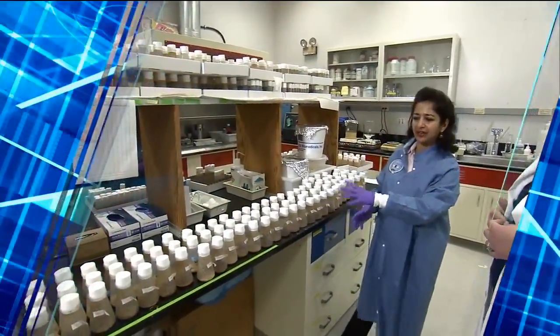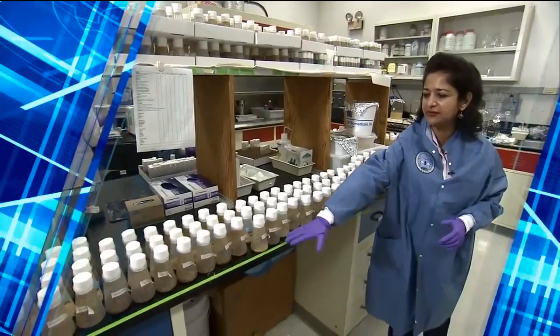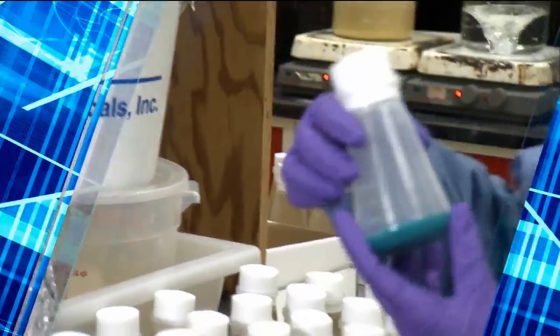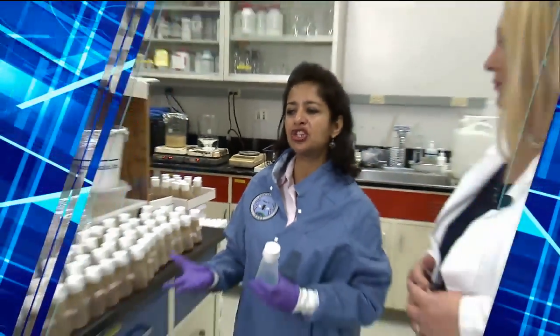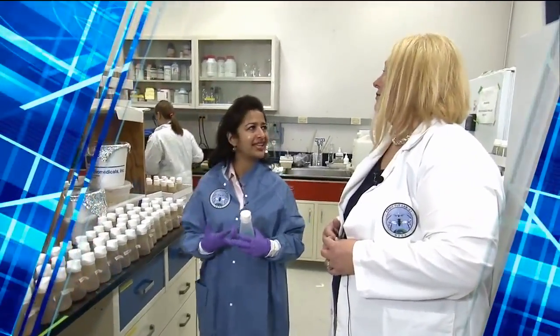What do fruit flies eat? So fruit flies eat a mixture. It's a nutritious diet. There are two different kinds of diets that we have in the lab. There's this food that you see in the white color, and then there's another one that we use for space flight that Shilpa was just working on, which is this blue color. We put this blue food dye in. But essentially it's a mixture. There's agar to kind of hold shape, but there's cornmeal, there's sugars like dextrose and stuff. There's some heat-killed yeast that we put in, to get proteins and vitamins and things like that. So it's a nutritious and complete meal.